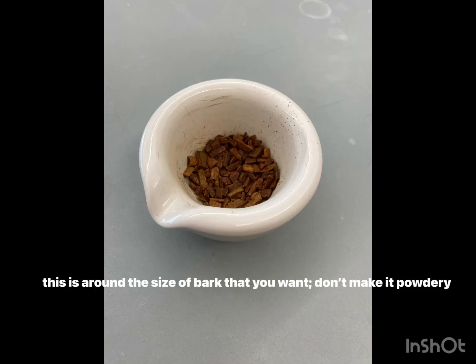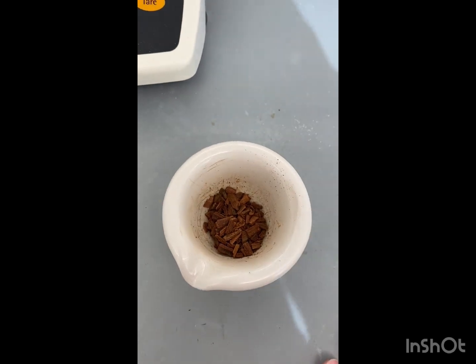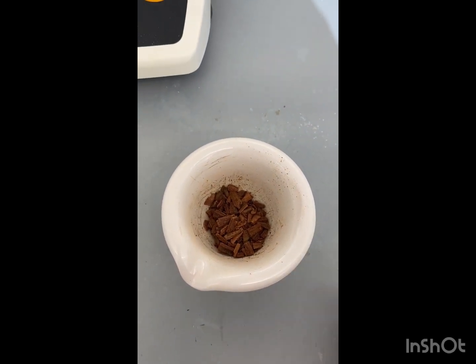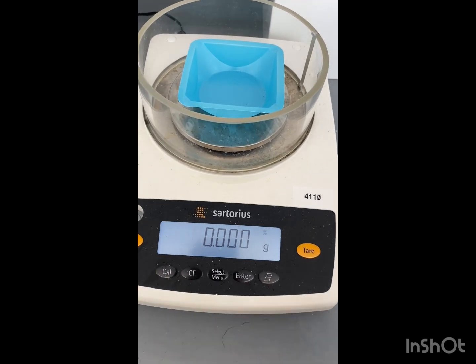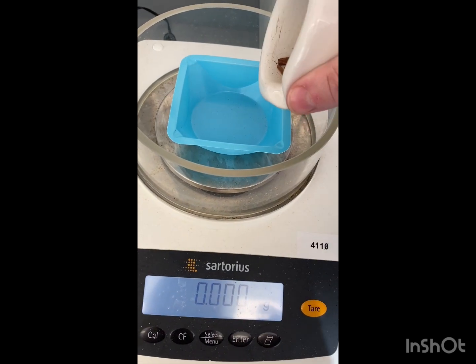First you want to get your mortar and pestle and you want to grind it up as best you can. We're going to weigh out about 5 grams. Now that we have our cinnamon crushed, we're going to add it to our weigh boat. And we want around 5 grams.